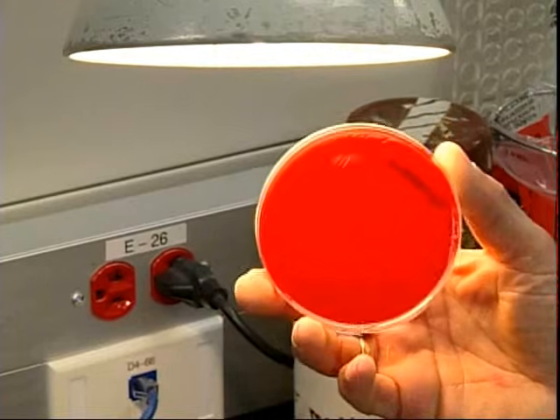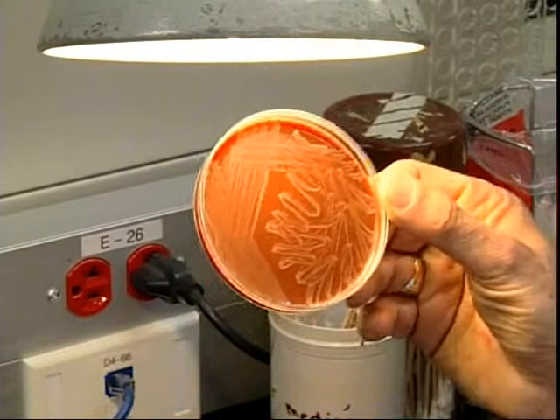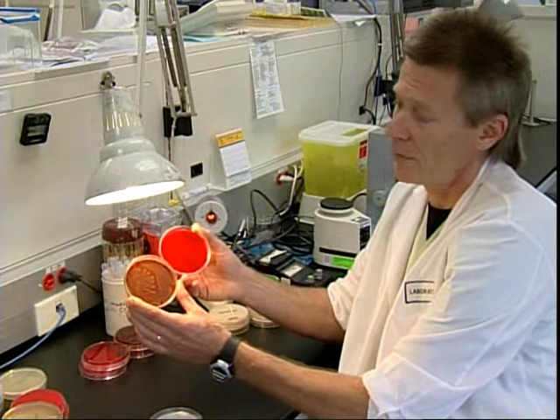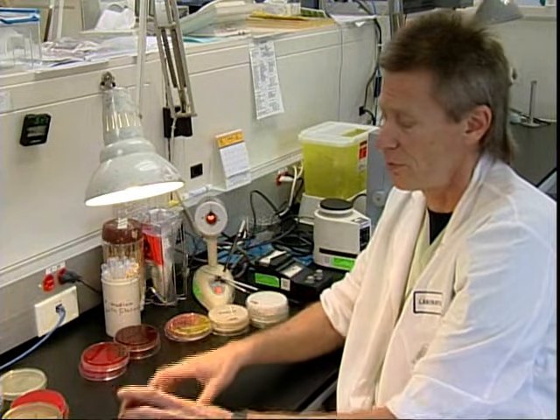If we just used the blood agar plate, we might get something like this: no growth at all. But by incorporating the chocolate plate, which is an enriched plate, it's more nutritious, we will find something like this. The same organism grew on the chocolate, but did not grow on the blood agar. This organism is Haemophilus. It's very fastidious and requires chocolate plates in order to grow.